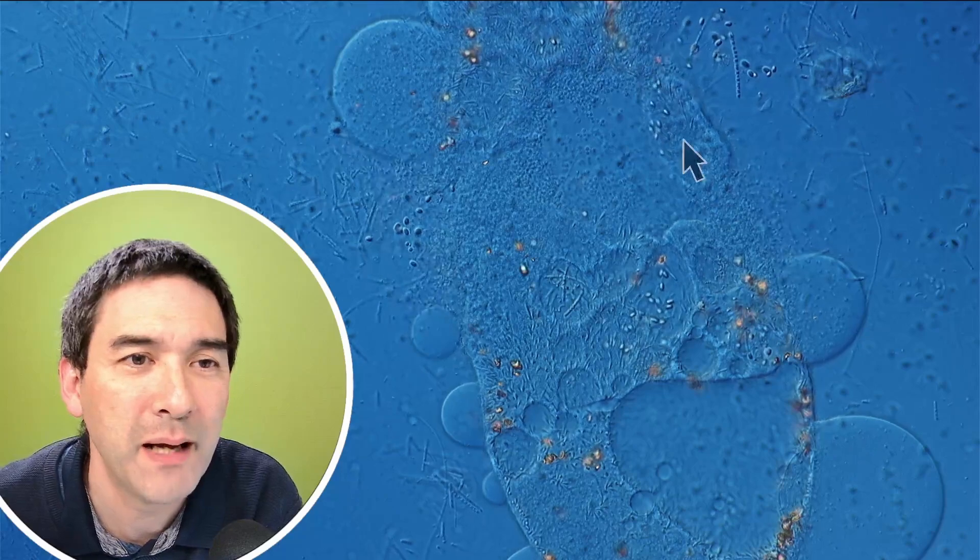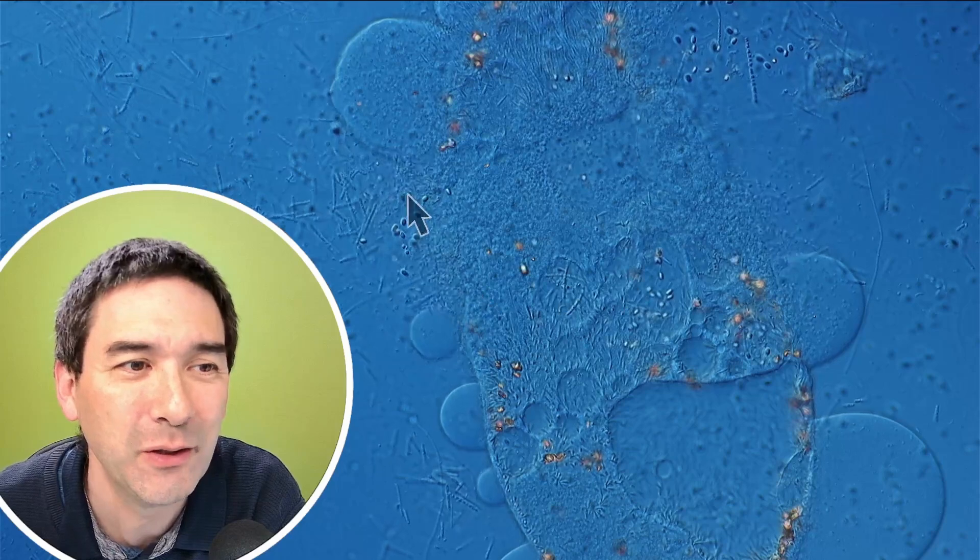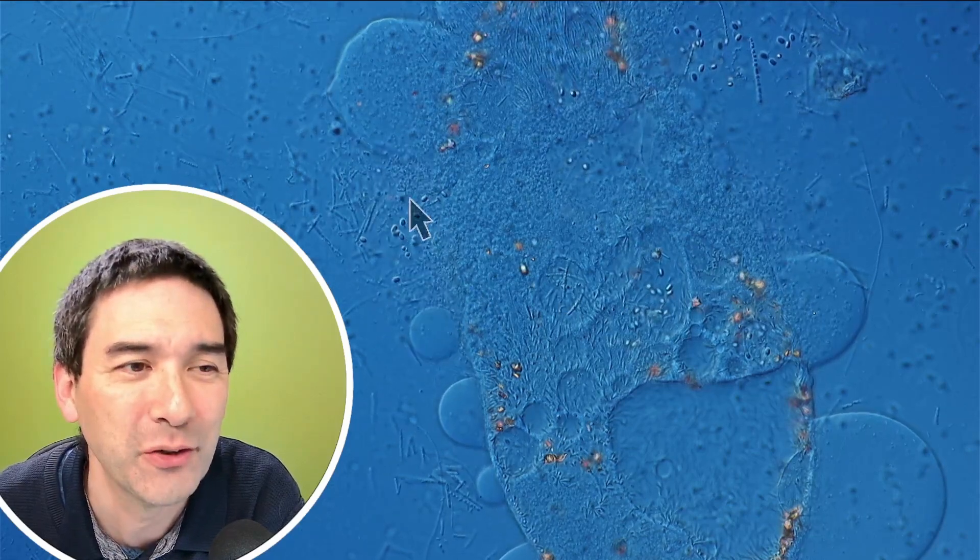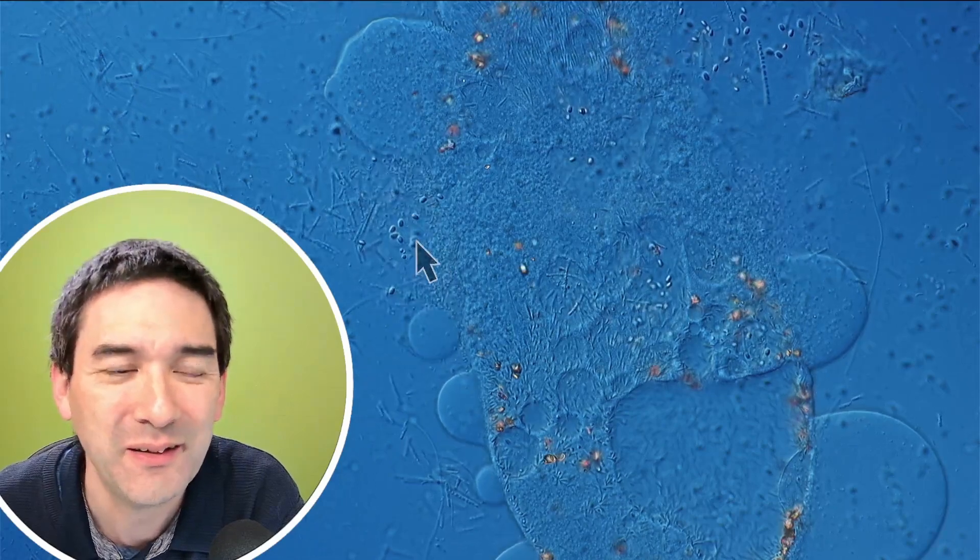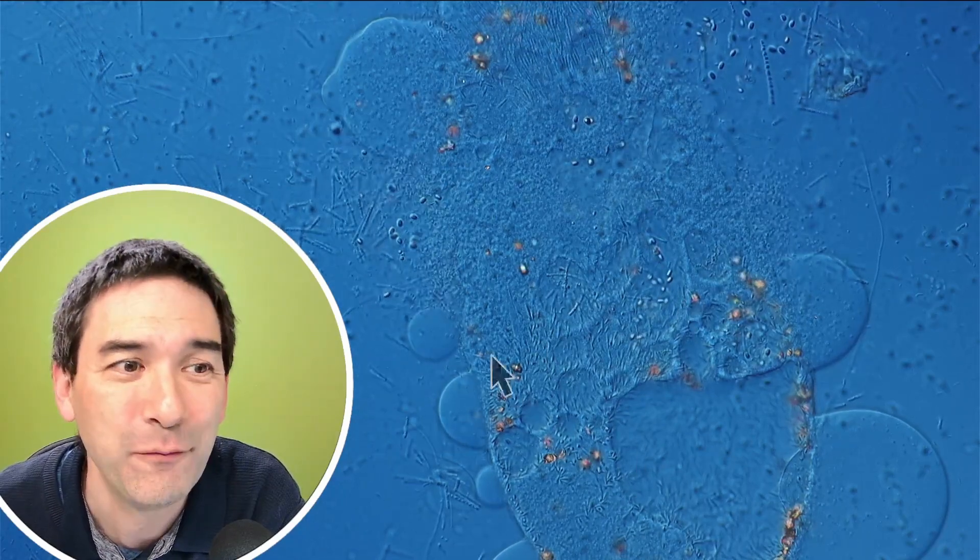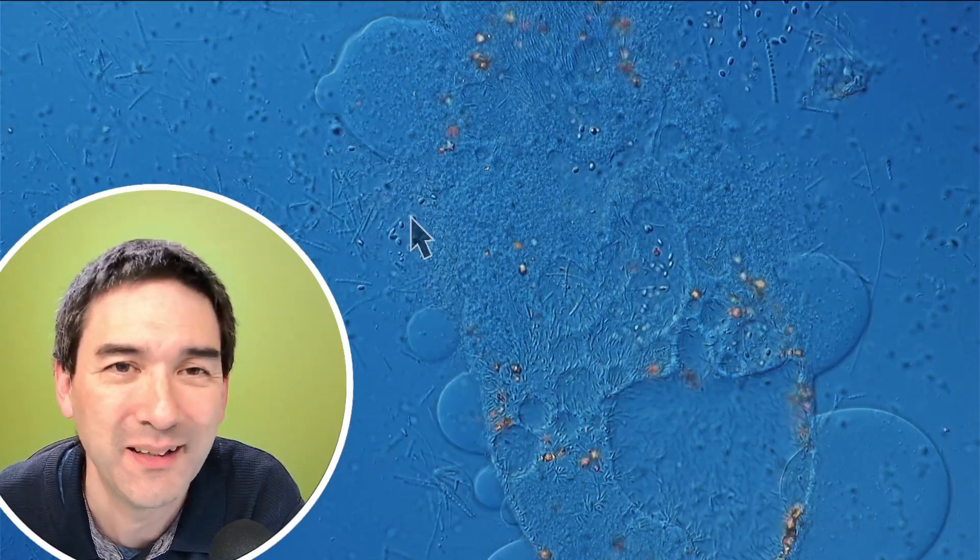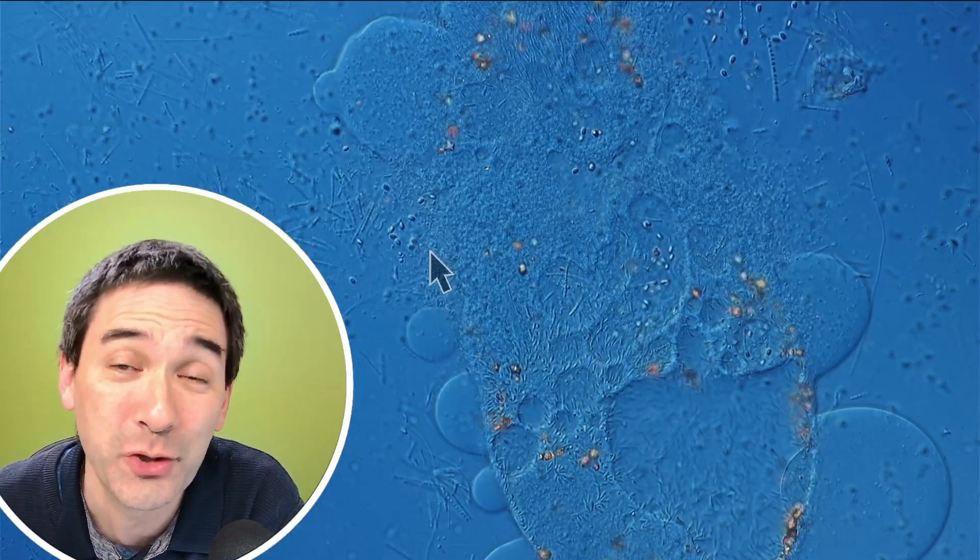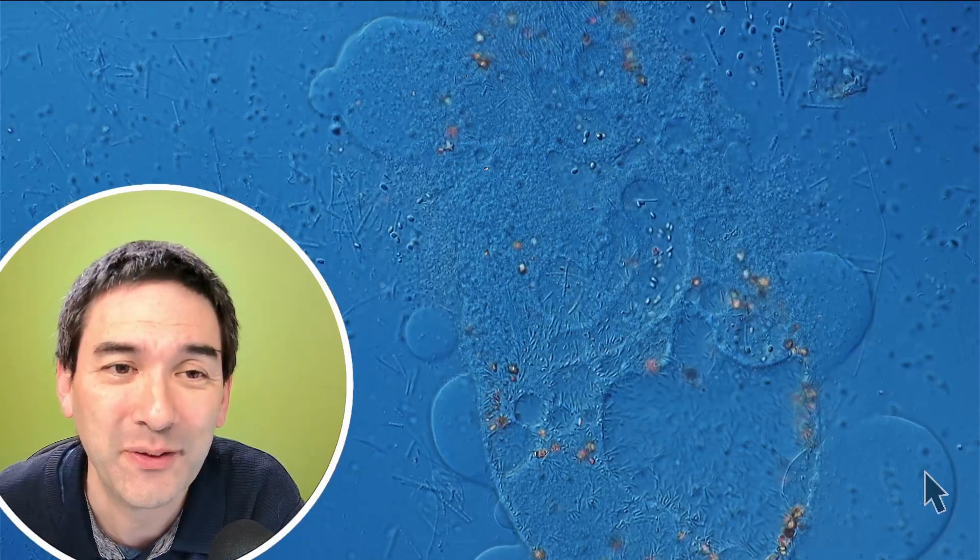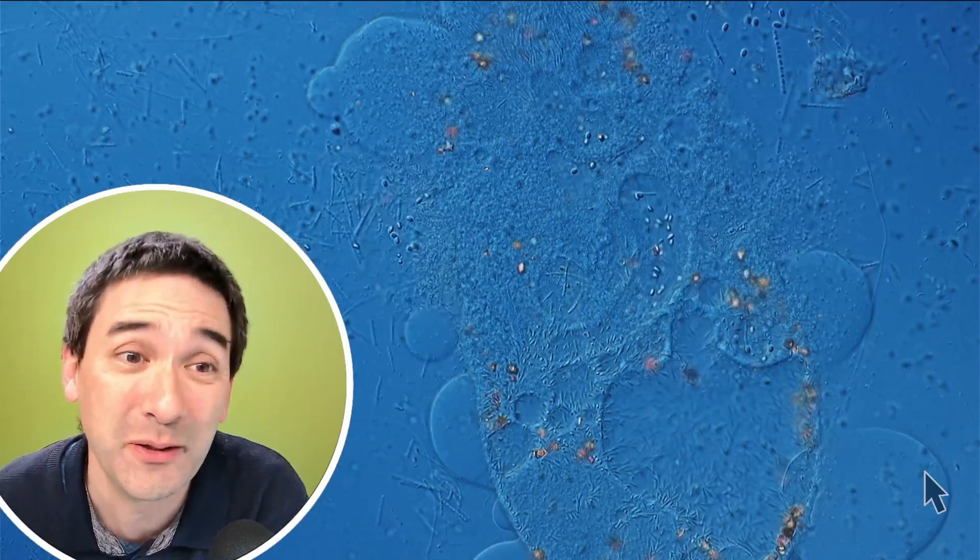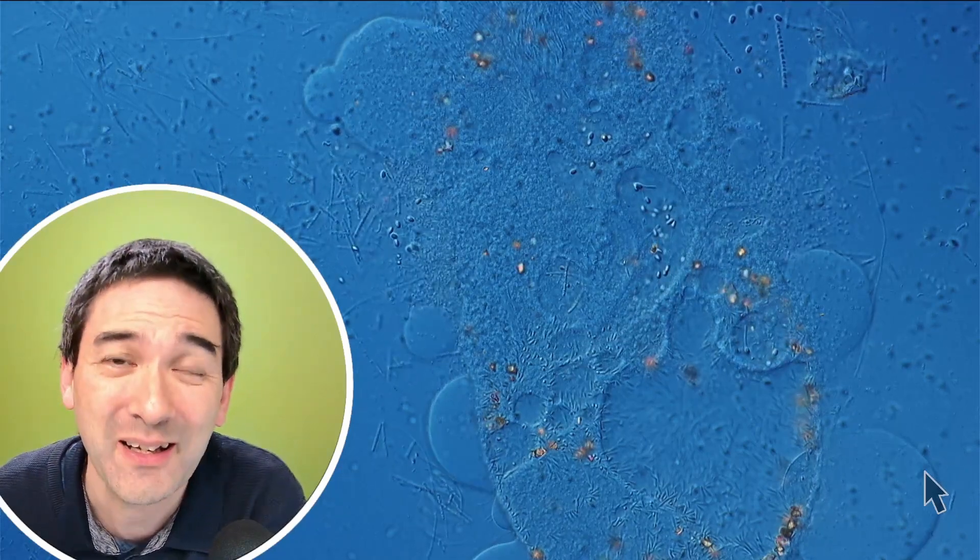And now at a very high magnification, look, the cell membrane now really did rupture, spilling out the cell's contents. But look at all of these tiny little moving dots that you see over here. They seem to be bacteria indeed. They're now using the paramecium as a food source. They're attracted now by the cell's contents that spills out, and that seems to be quite nutritious for those bacteria as well. They're now starting to gather around the cell and starting to consume it. So you see in nature, everything is being recycled again and used again. Nothing is wasted.